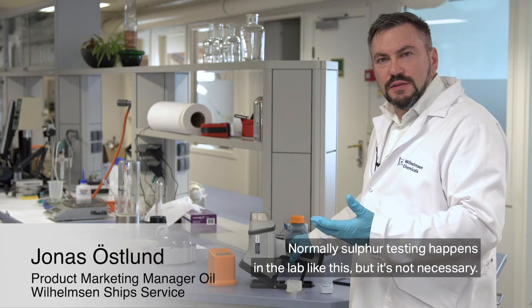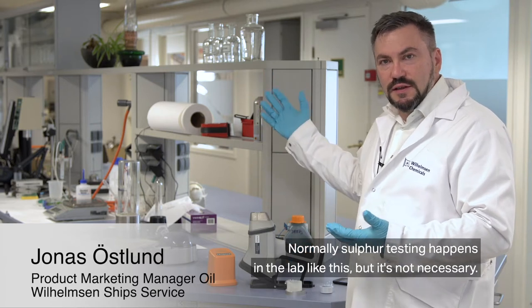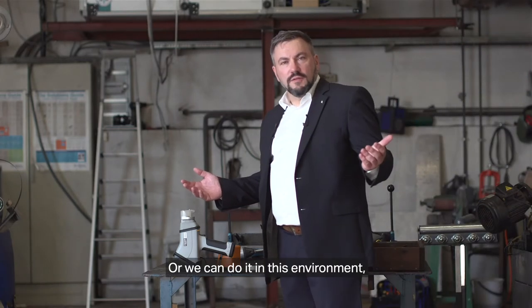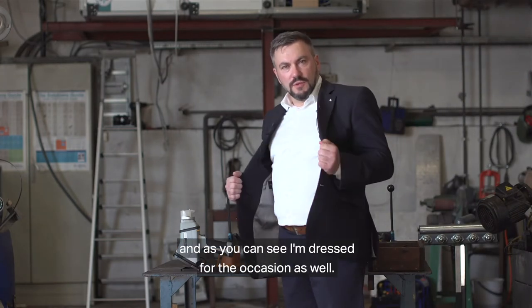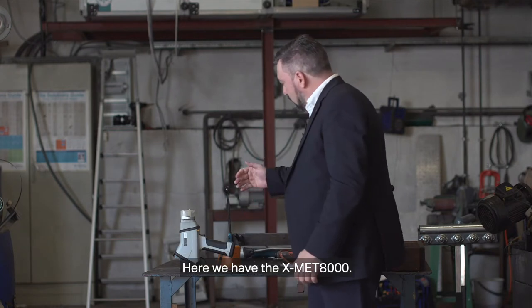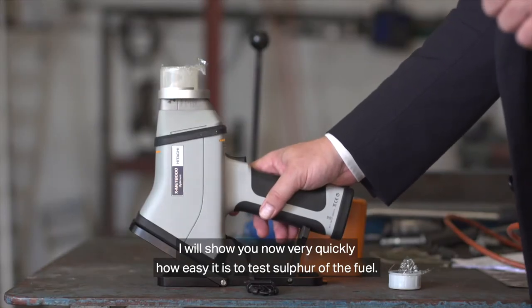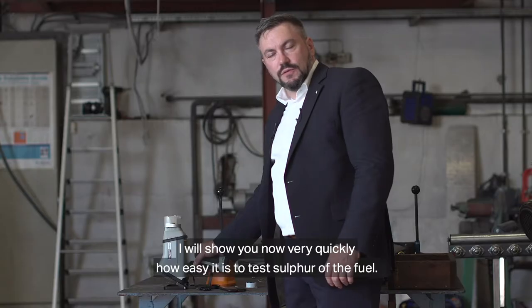Normally sulfur testing happens in the lab, but it's not necessary — we can do it in this environment. As you can see, I'm dressed for the occasion as well. Here we have the XMET 8000. I will show you now very quickly how easy it is to test sulfur of the fuel.